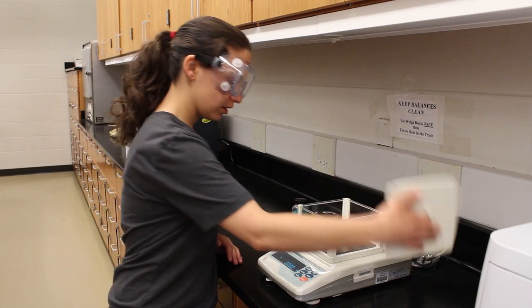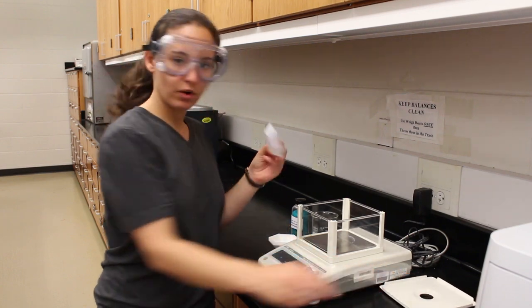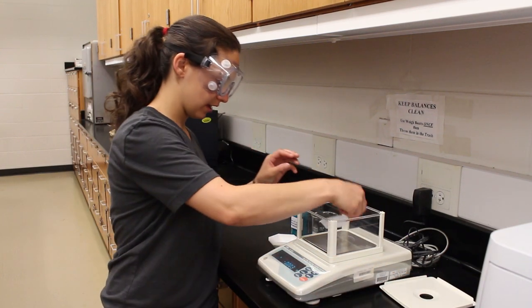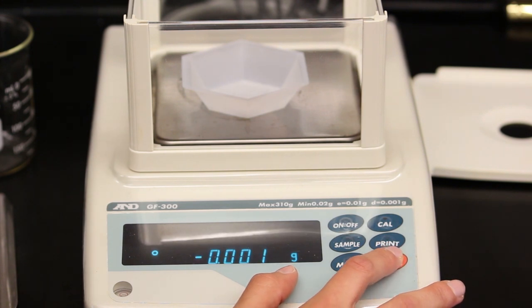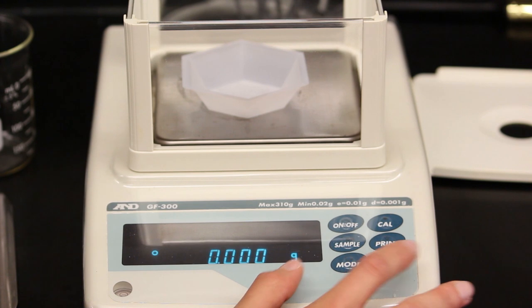To weigh a substance, you'll need to take a plastic weighing boat and place it on the scale. Then press the re-zero button, or the tare button, so that the weighing boat is 0.000 grams.